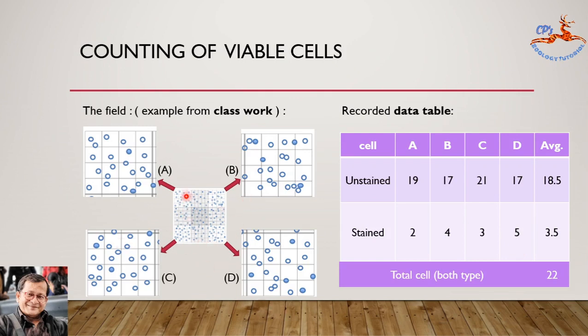Now let us count the cells. Under the 10x objective you will find four coordinate chambers marked A, B, C, and D. You will see both stained and unstained cells. Your purpose is to count every set of 16 cells and record in the table — unstained and stained cells separately — for chambers A, B, C, and D. You will get the average cells per chamber, and by adding the two cell types you will get the total number of cells.